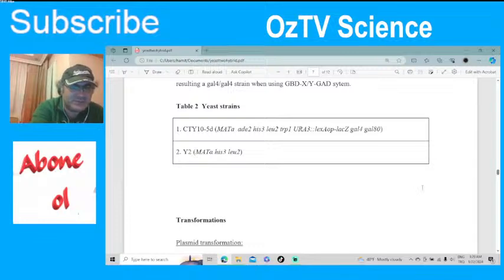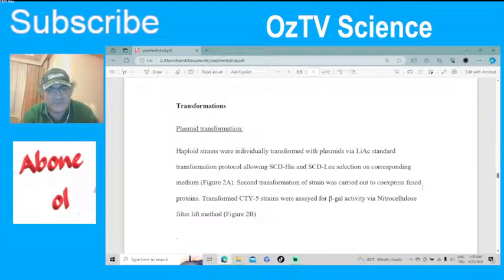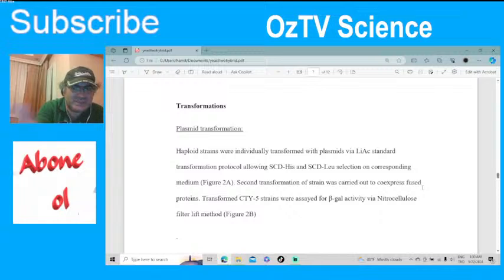So you arrange these mutations so that they complement each other. Like this one has a histidine mutation, this one has an adenine mutation, for example. When you combine the two, you can make prototrophic cells, and add or subtract what is necessary in terms of media. And then the plasmid transformations: you insert the plasmids into the yeast. It's a lithium acetate standard transformation protocol. I did that many times.